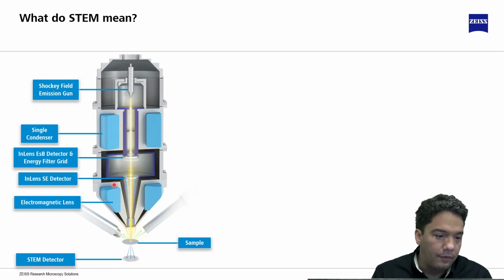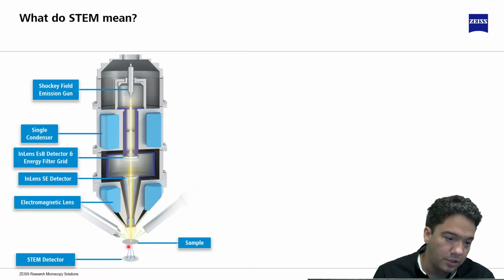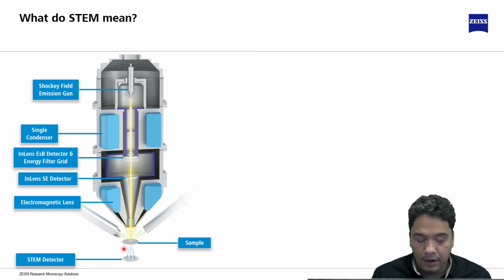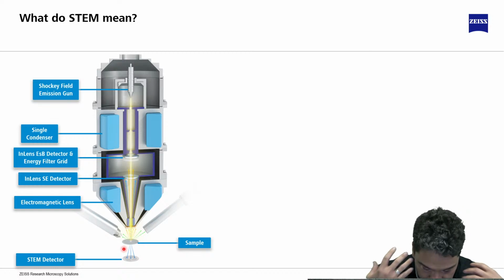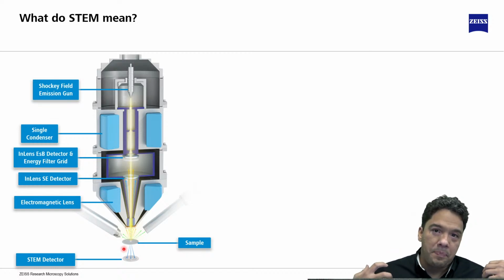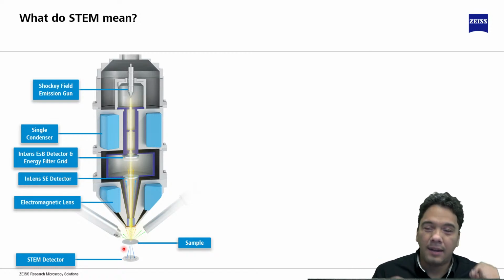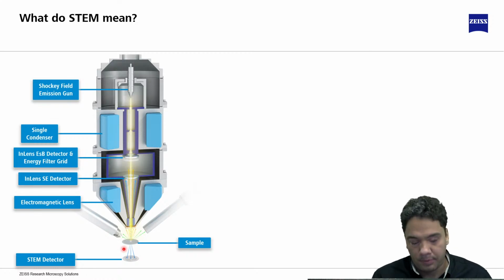But we also have other detectors with which, of course, we can acquire other information if we don't have, for example, all the capabilities to prepare all these ultrathin sections, which is difficult. I know this is time consuming. It's difficult to get the right, pristine ultrathin section.